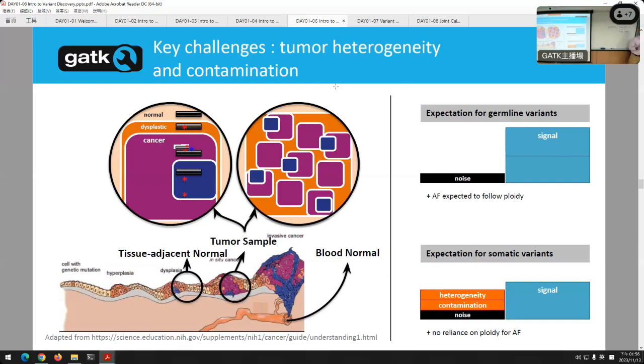Cancer is very different. Remember, when you try to extract a tumor tissue, you're not getting it perfect. You get some of the normal tissue also, the non-tumor tissue. Also, every cell in the tumor is different because they're all expanding and growing and changing very rapidly. And so you have two types of contamination. Your normal tissue is contaminating your tumor, and the tumor is so different. And so the signal to noise ratio is so massive in the cancer use case. So that's why the cancer team says we have a way harder problem than anyone else.